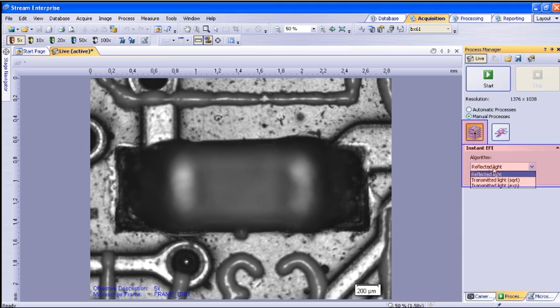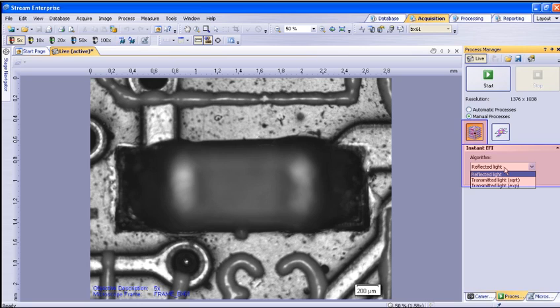The reflected light algorithm will capture the most in-focus pixels when using your light microscope or stereo microscope in bright-field mode. The transmitted light SQR uses a quadratic weighting function, or transmitted light EXP uses an exponential function to capture the focused pixels when using your light microscope or stereo microscope in transmitted light mode.